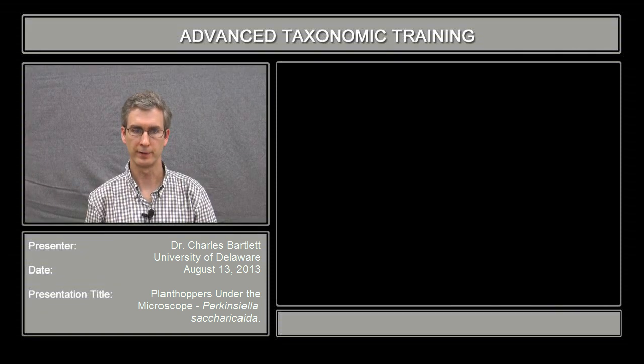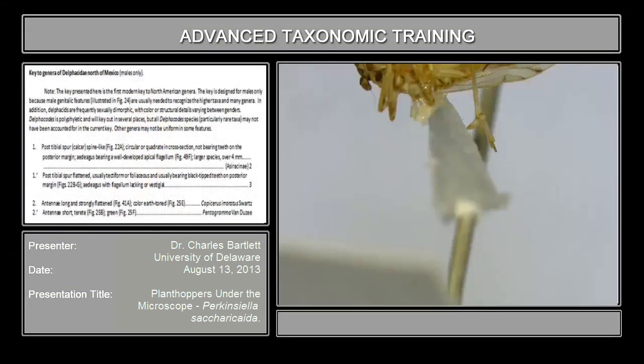I'm Charles Bartlett from the University of Delaware. So if you go to your key to the delphacids north of Mexico and we look at the very first couplet, the first couplet has to do with the calcar — the spur — and it reads post-tibial spur.